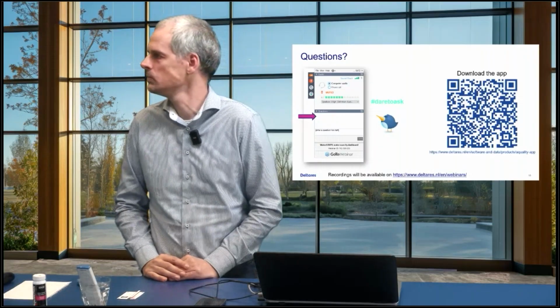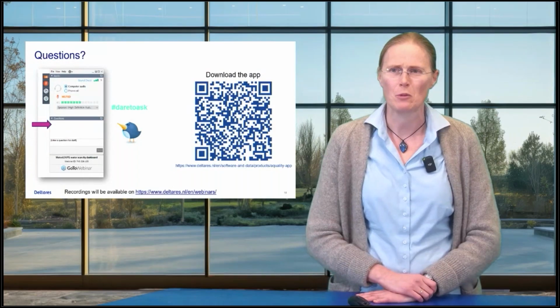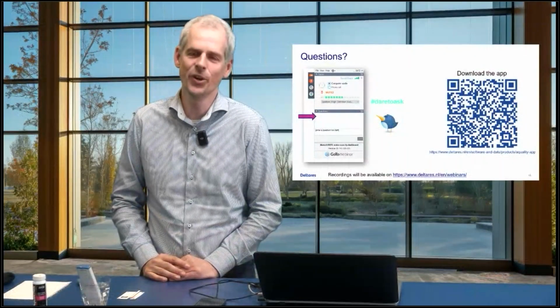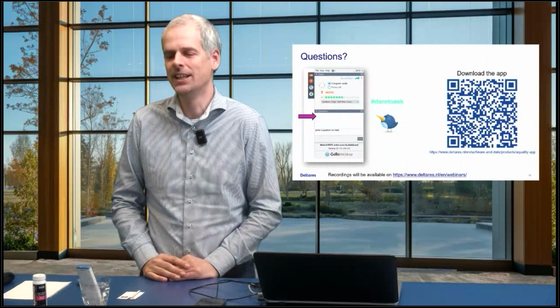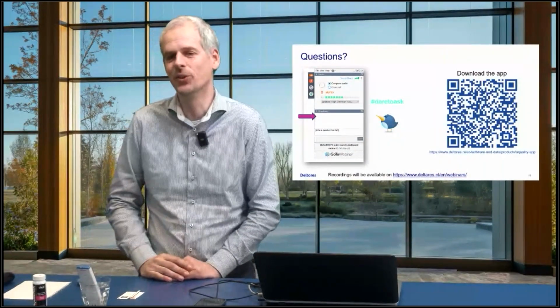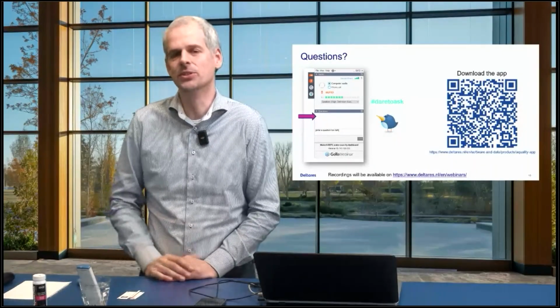Yeah. Hey, and there's also a question to see that, can the app create graphs or report by itself? No, that is on our wish list, by the way. To be able to make a graph of your multiple measurements at one location, you also have to connect each measurement to a location.